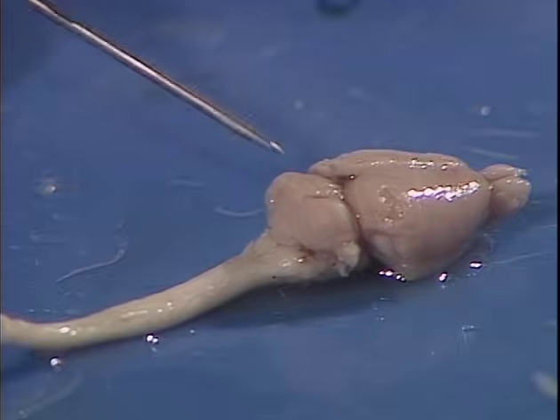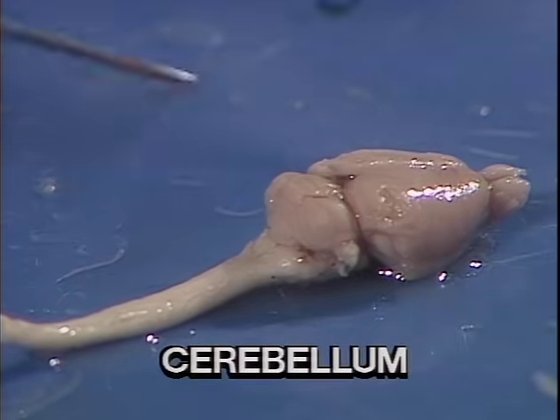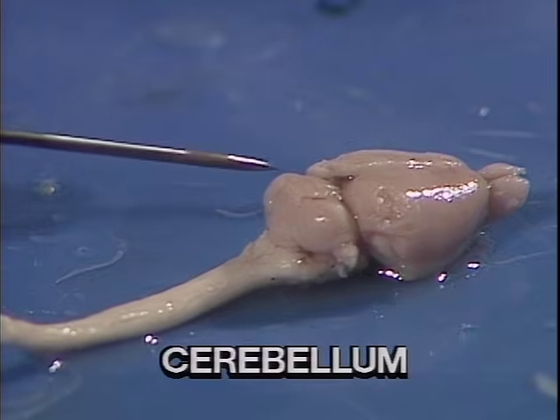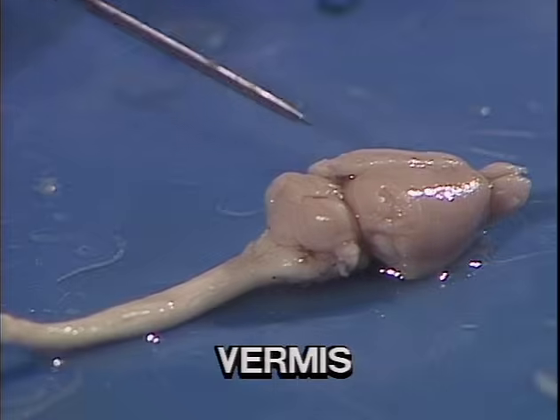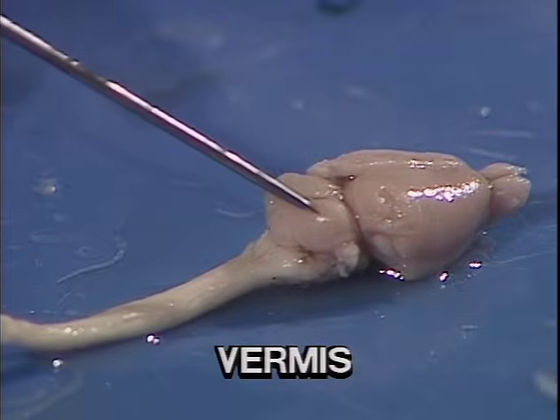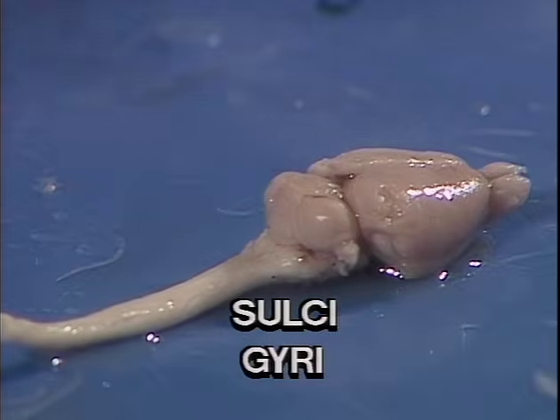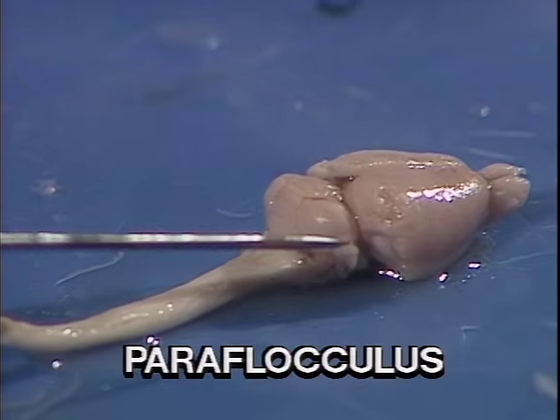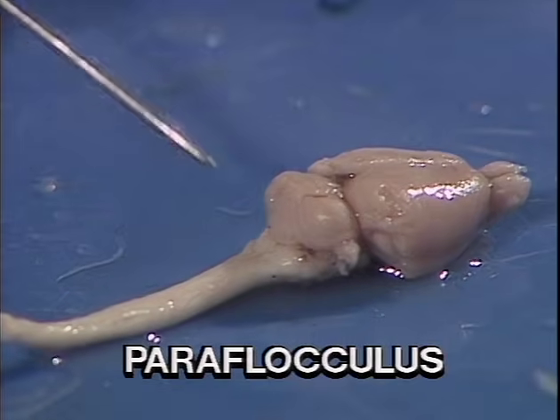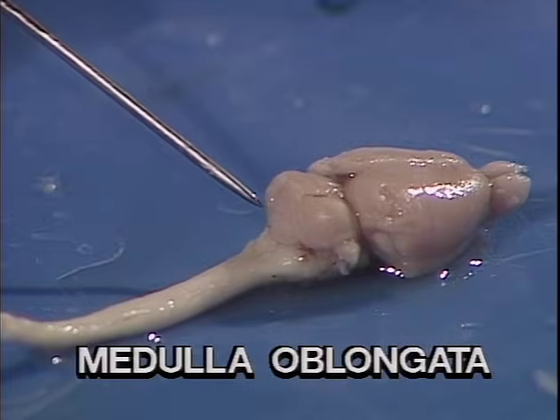This is the cerebellum. It is a highly convoluted structure. It consists of 2 lateral hemispheres and a medial vermis. The deep fissures are known as sulci, and the folds are gyri. Off to the sides, we can see here the paraflocculus. The posterior portion of the brain is known as the medulla oblongata.